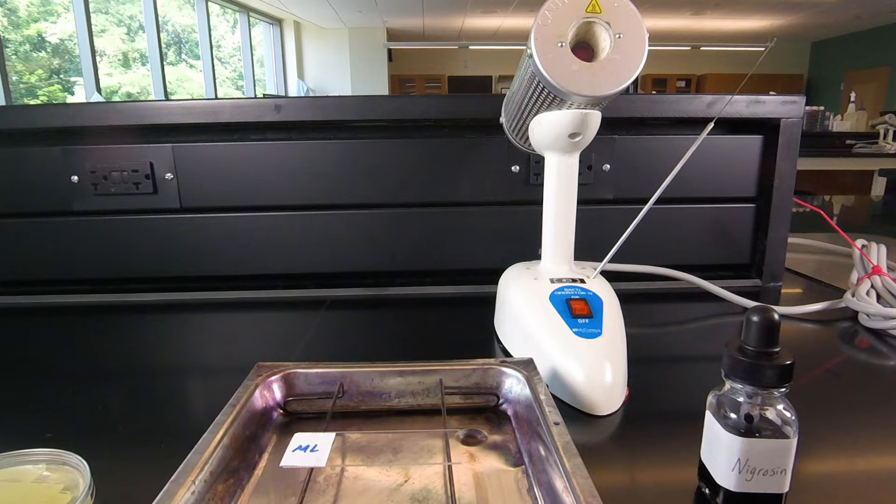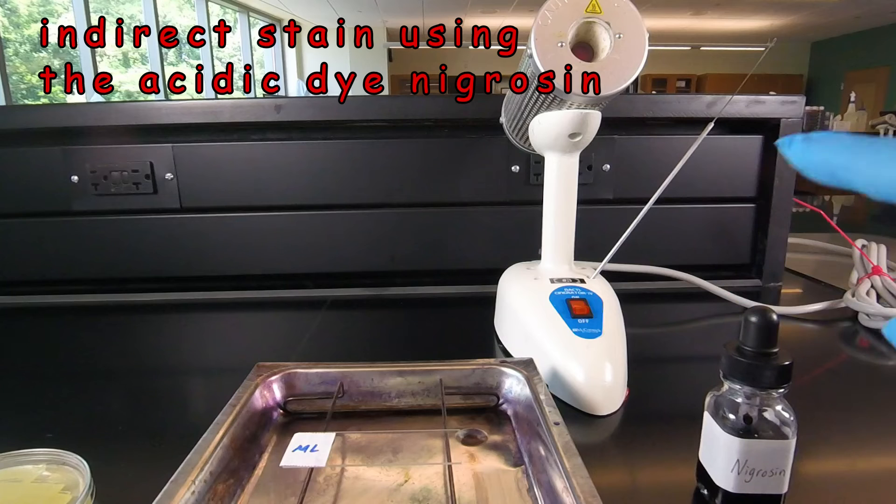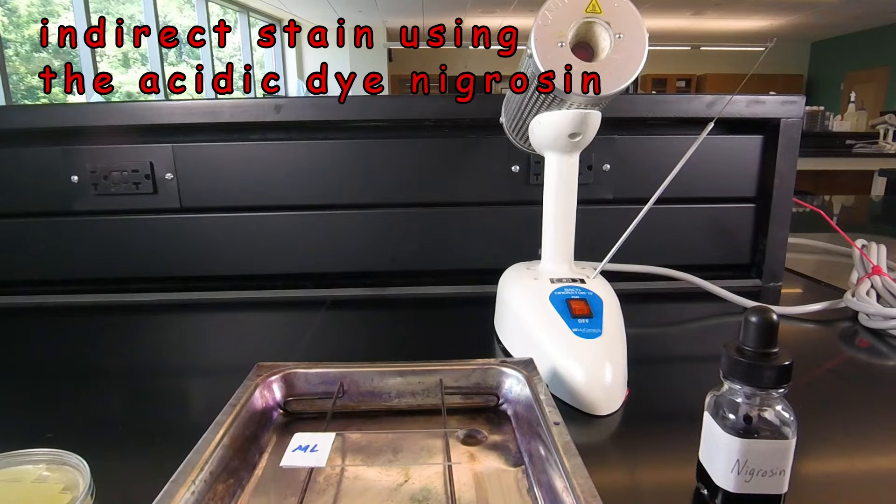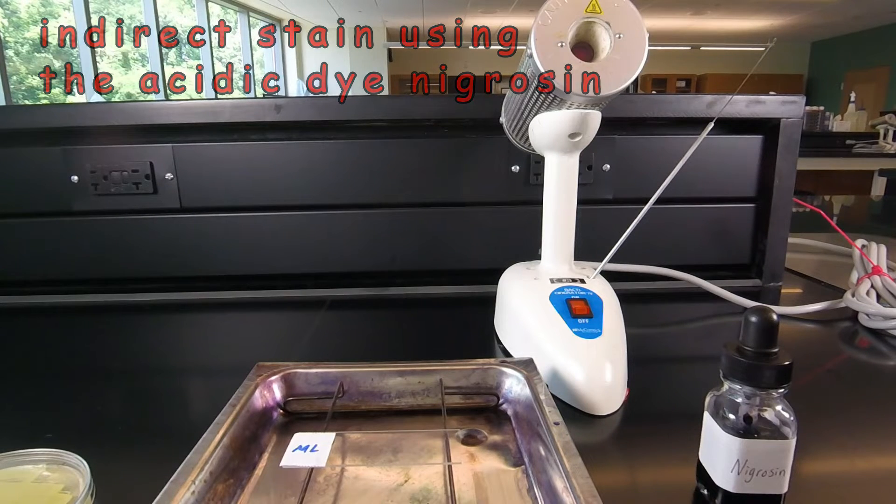In this video lesson, we're going to learn how to do an indirect stain using the acidic dye Nigrosin. Now in an indirect stain, we're actually staining the background of the slide rather than the organism itself, which is why it's called an indirect stain.